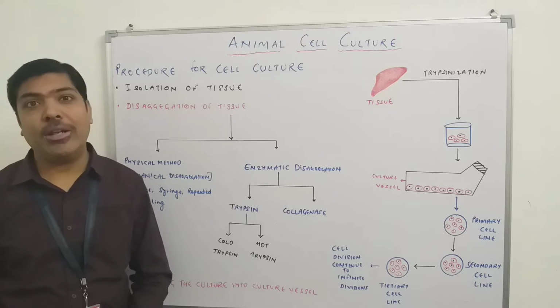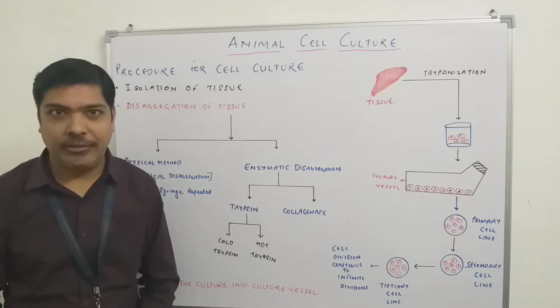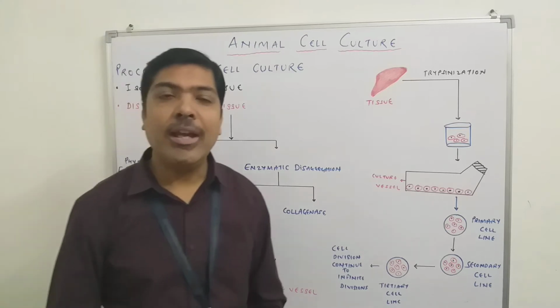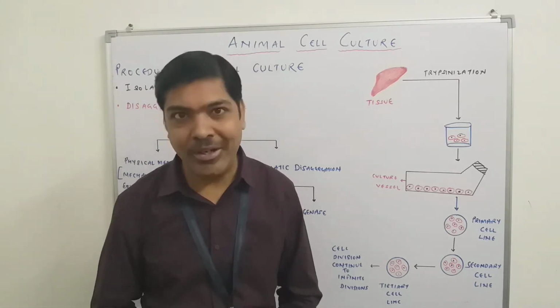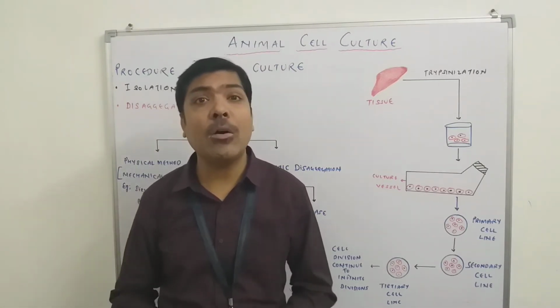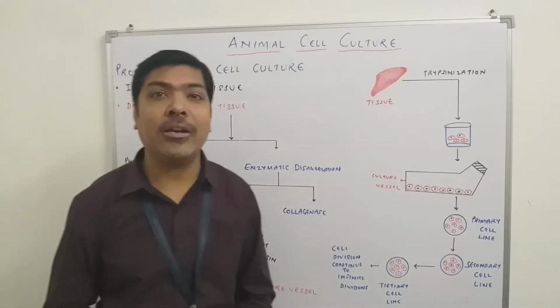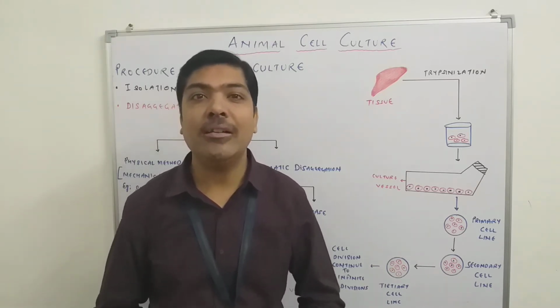In today's video lecture, we'll discuss animal cell culture technique. In the last video, we went through the introduction of animal cell culture technique, and we also introduced various terminologies related to it. We also discussed various applications of this method and covered various nutritional requirements that are necessary for the growth of the animal cell culture.